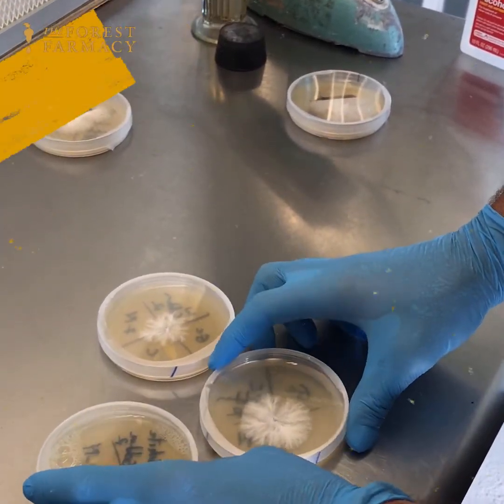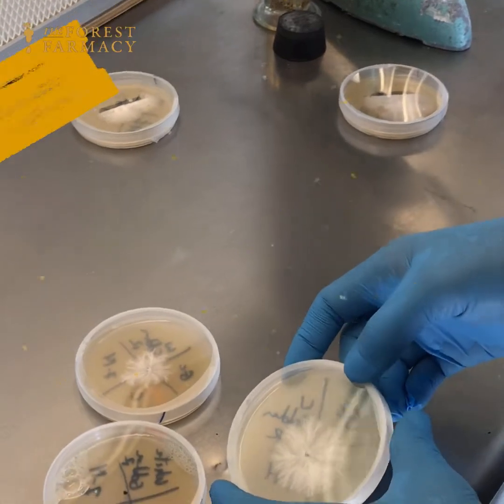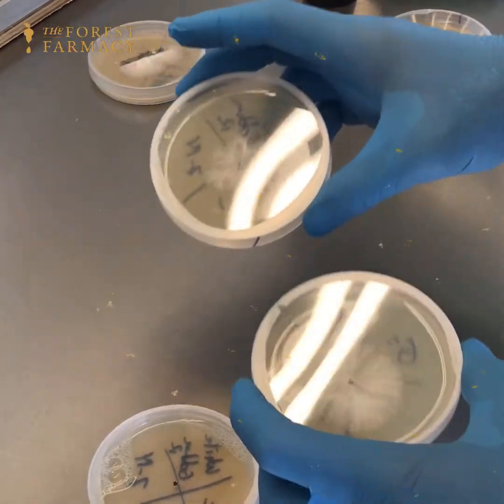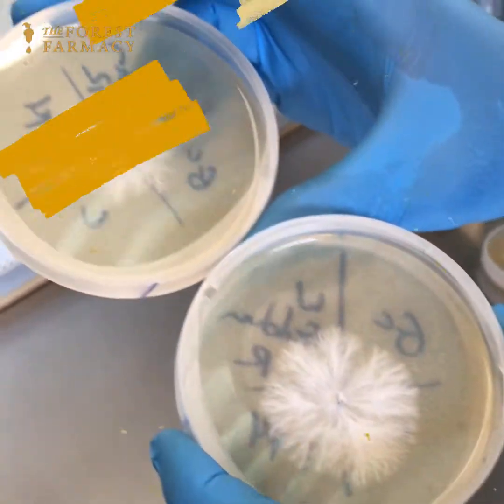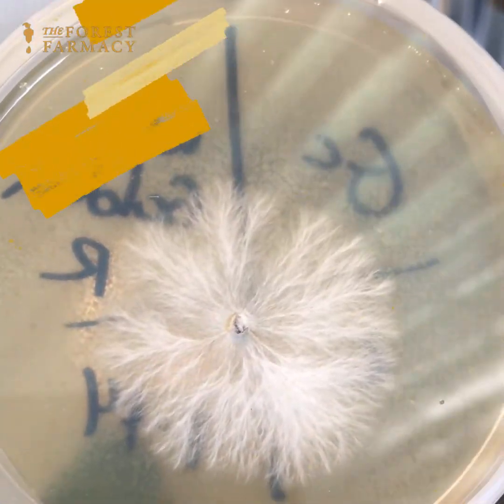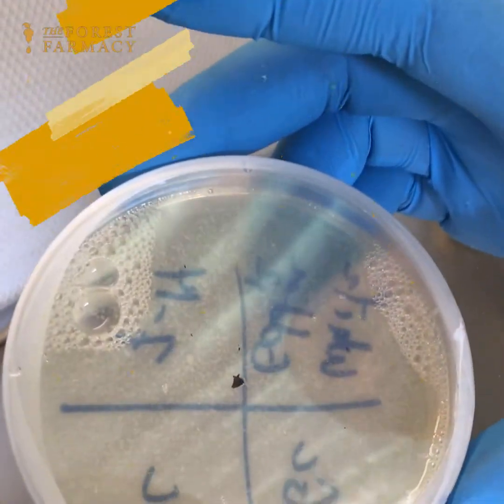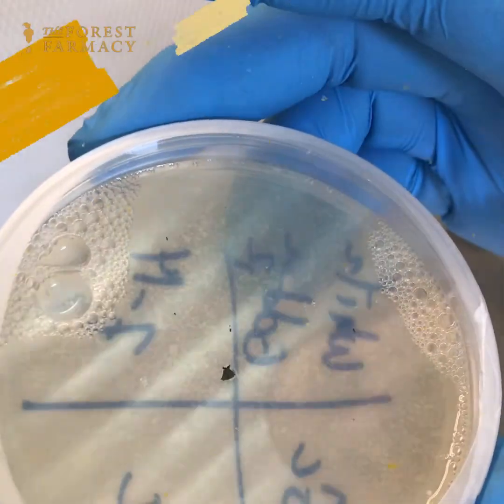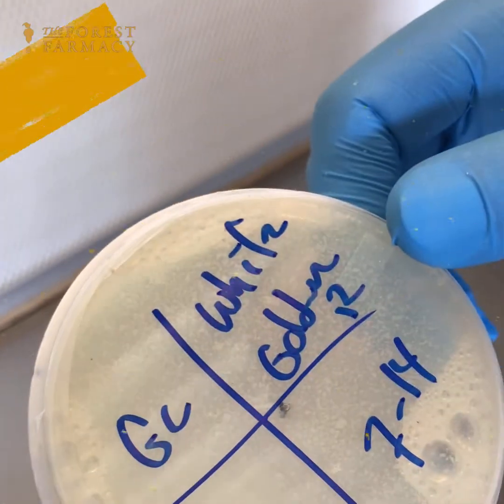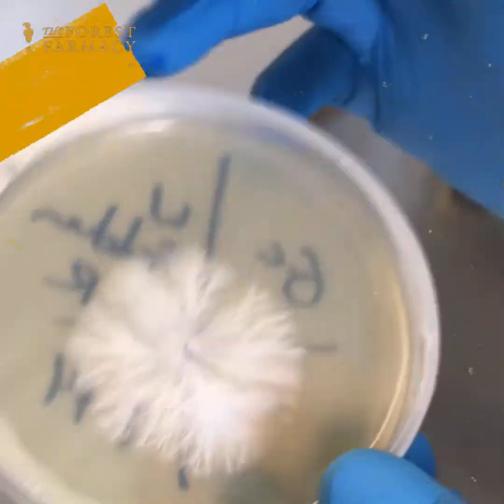I cloned this mushroom by taking a piece of the tissue — tissue culture. I always do at least two plates, most of the time three if I have them. You can see these two really amazing, beautiful rhizomorphic mycelium on these plates. This is the reason I do more than one, because this one — from the same chunk of tissue — did not really do very much at all, while this one jumped first.